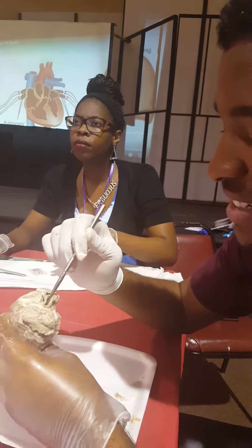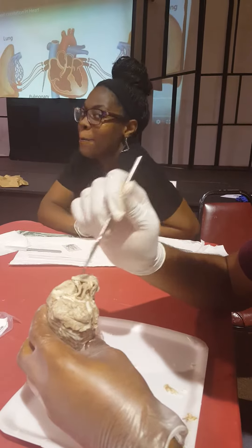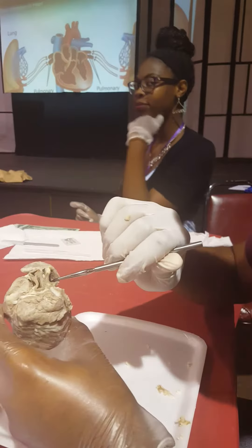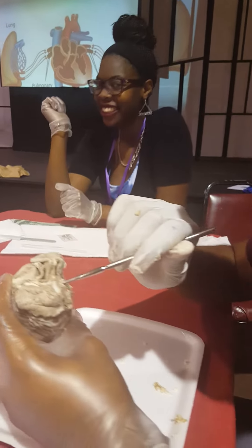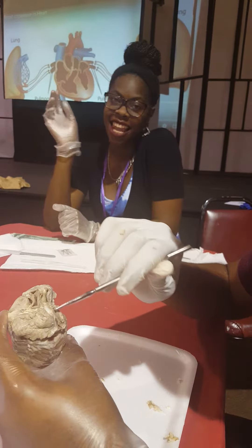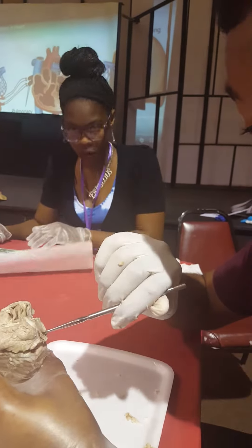So this right here is the aorta. Then this part here is the pulmonary artery. And they're kind of close. And then right here is, I believe it's the superior vena cava — I could be wrong. And then this one right here is the inferior vena cava. And then this one right here is the pulmonary vein, possibly.